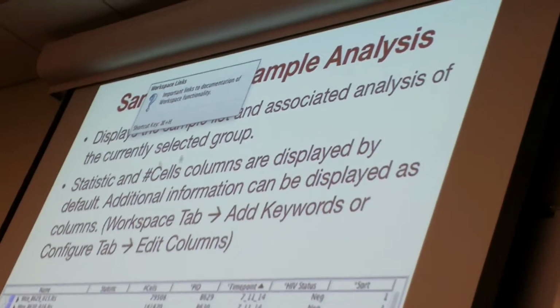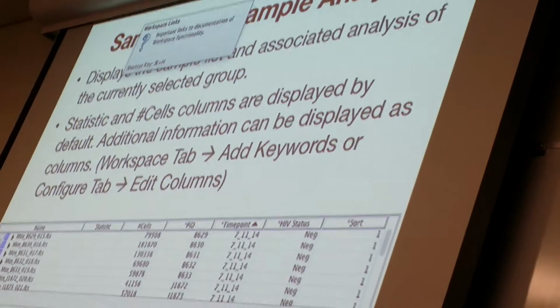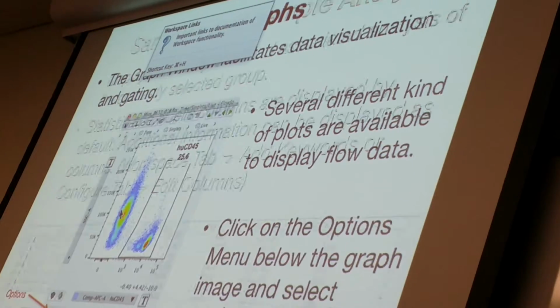Sample and the associated, get rid of that workspace link shortcut.